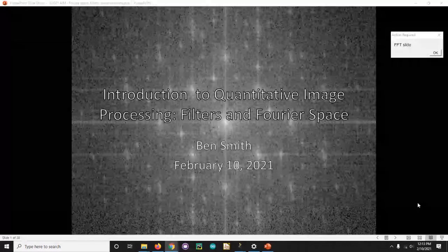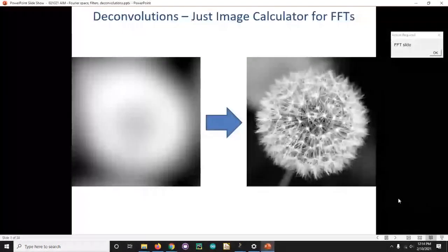And if you have time, I'm also hoping to get to deconvolutions, because it turns out the math underlying deconvolutions is very simple once you understand Fourier transforms. And to show you that this type of deconvolution is mathematically possible, and you can do it in ImageJ in one step. It's very fast. But also then through that, to get into why when you try and deconvolve a microscopy image, you don't get this result where you get extremely high resolution from an extremely low resolution image. Okay.